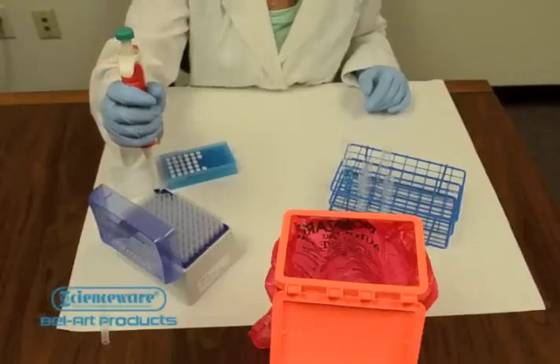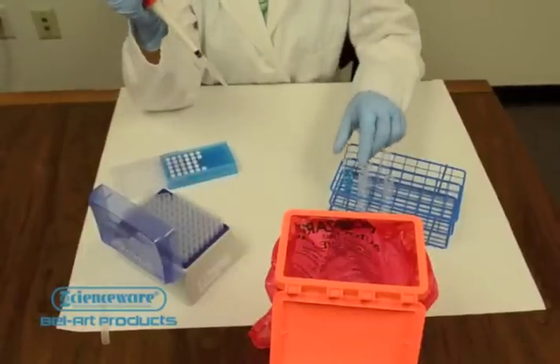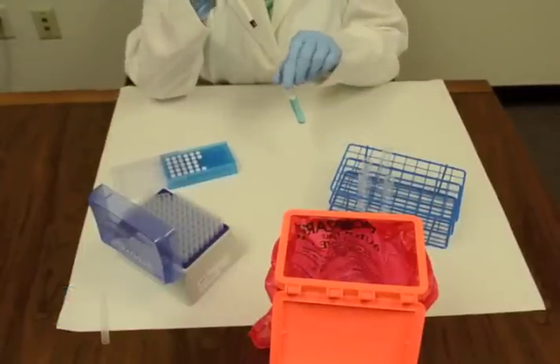Flomi cell strainers are unique strainers that provide fast efficient filtering with minimal sample loss while providing reduced risk of cytometer clogs.